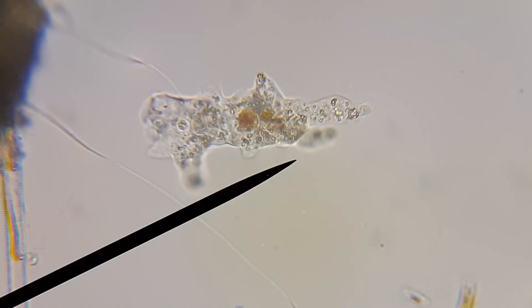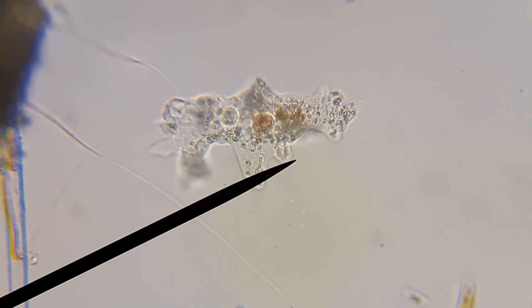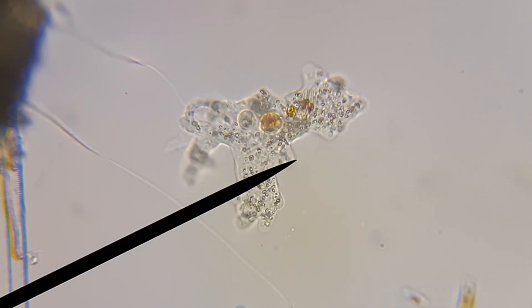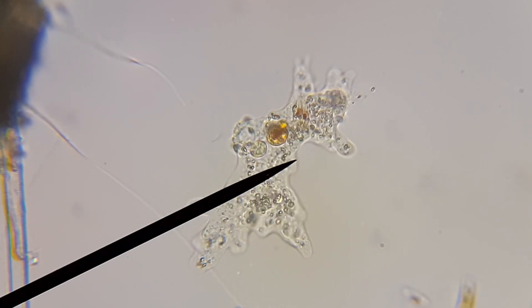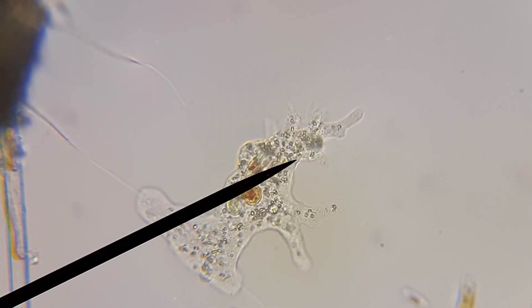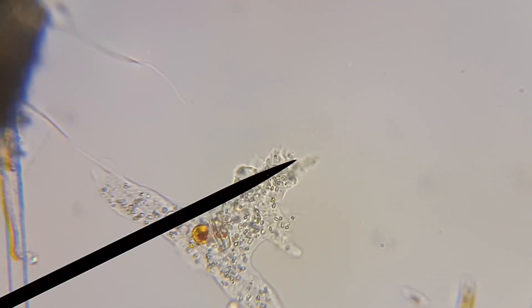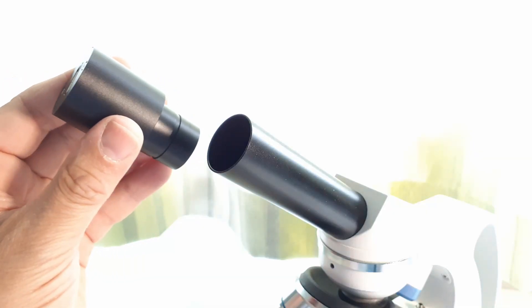Another amoeba that I found. This water sample did contain a lot of amoeba. This one is now in time lapse to see the movement a little bit better.